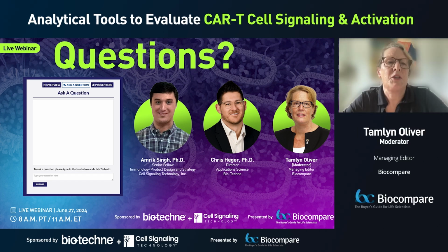All right, thank you. Next question. Do the CAR linker mAbs have utility in detecting CARs in FFPE tissue?